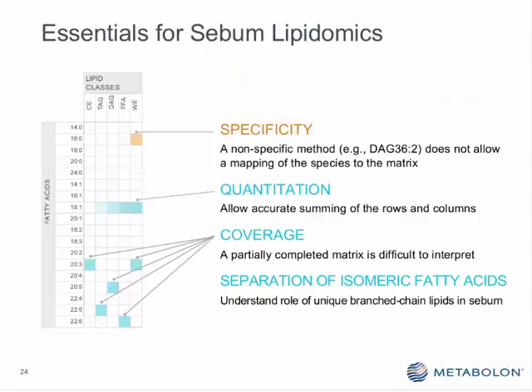So this does mean that there are certain very important requirements for any analytical method in order to enable that sort of analysis. One, it has to be specific.